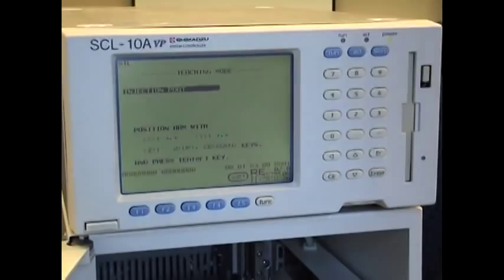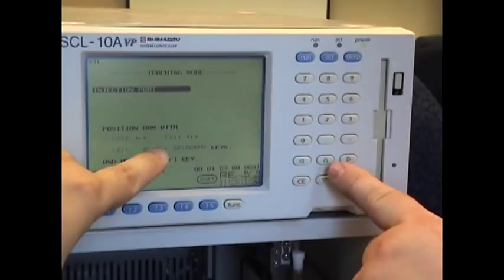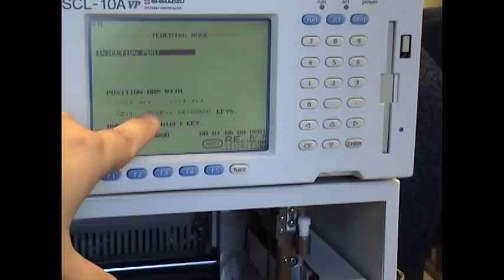It will then give you the instructions on how to use it. Notice the X axis is left and right. The Y axis is up and down. And the up and down direction, the actual Z direction, is zero and CE for the keypad.